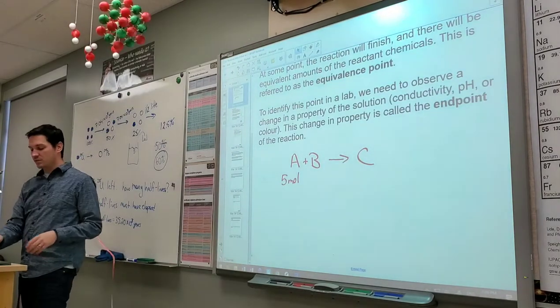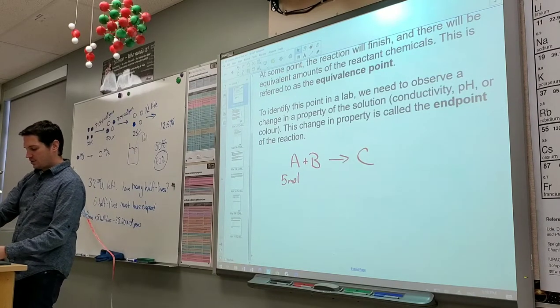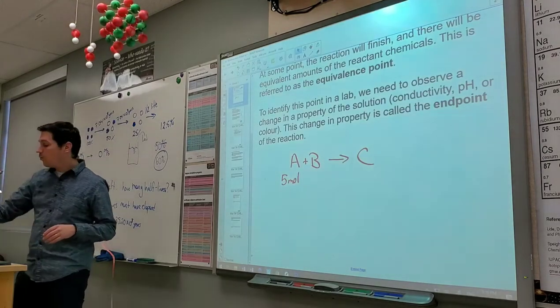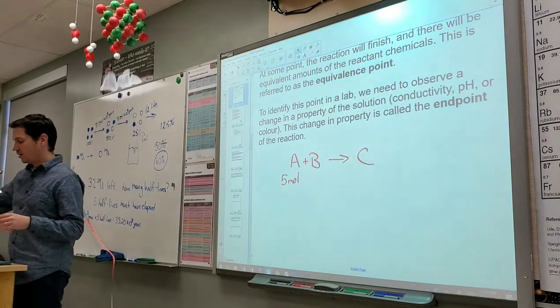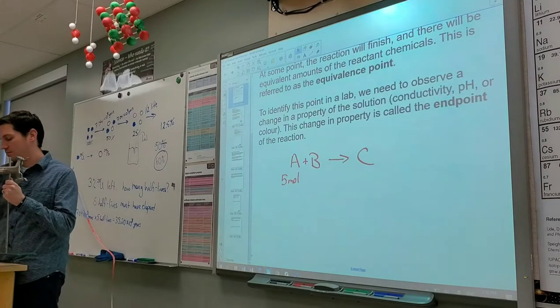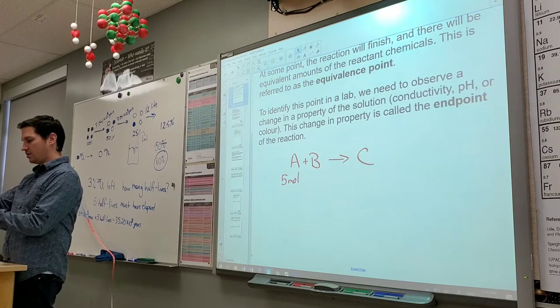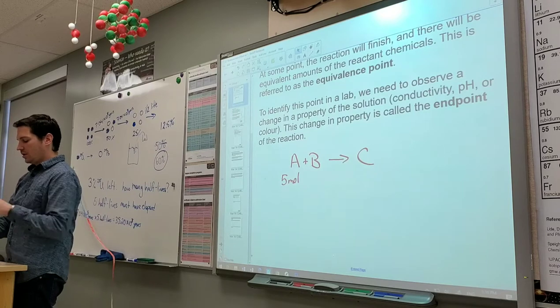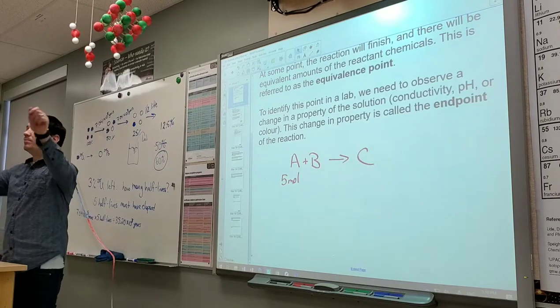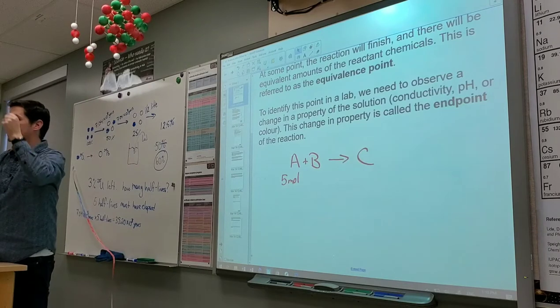So we're taking one solution and adding it to another. That's my hydrochloric acid, good. I don't know how well you can see this, so I'll try and prop it up as best I can. There we go. So I've got what can be considered a blue solution. And because there are graduations on here, I know what volume of solution is in here to start with.